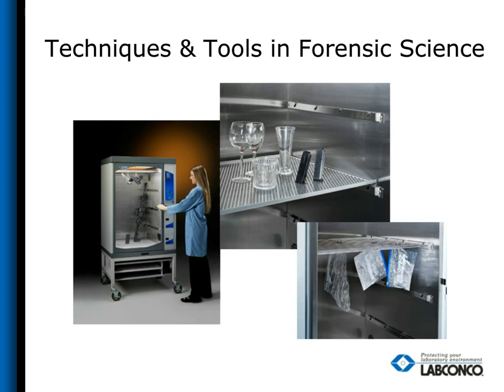You have different types, different sizes, different brands. Some of the best ways to sort these out is to take that actual square footage and divide it into the cost of the unit so you can actually figure out what your cost is per square footage. Give you kind of a baseline to compare different types of systems. How many shelves, bracket holders, things of that do you have to allow you to move evidence throughout the system so you can maximize the different cycles?